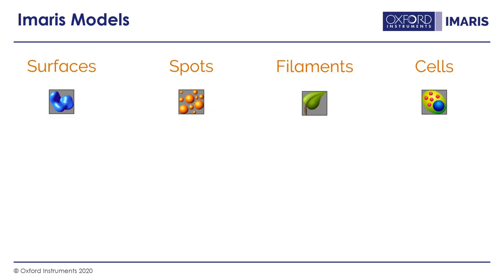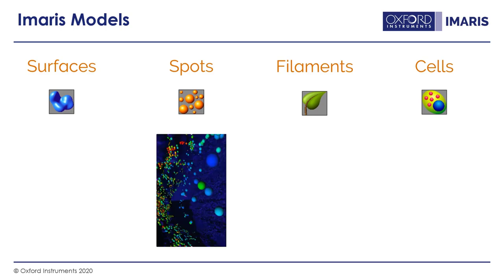In earlier parts of this webinar series, we already introduced the segmentation models that Imaris provides for image analysis: the surfaces, spots, filaments and cells. The spots are developed for identifying the position of small puncture-like structures in your datasets, for example vesicles or nuclei. They are not identifying the shape of the signal, but only the position, intensity and size. They are a great tool for counting objects and analyzing their distribution.